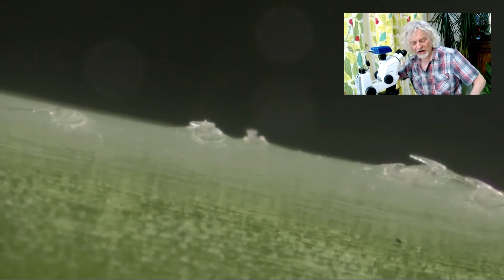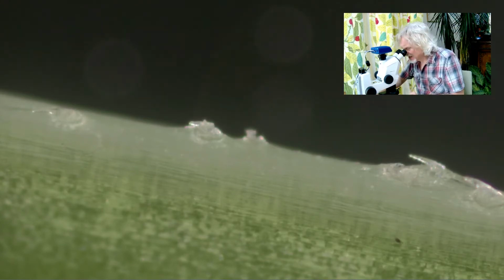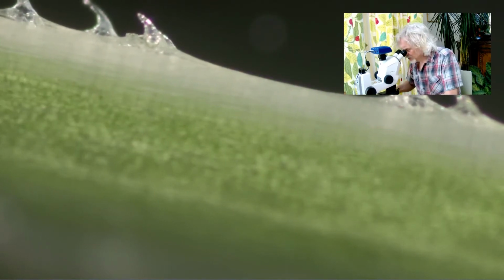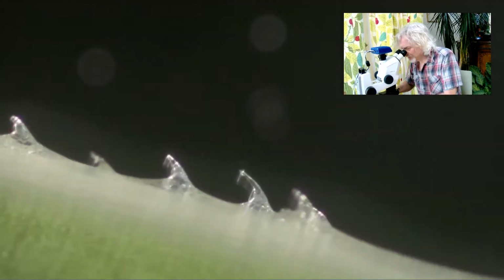This is very high magnification, and this is something that people forget. If I take this probe here, now this is a needle, this is a sharp needle. If I place this next to this, let me find a better hook. That one's a bit rubbish. I think I've sort of scraped a lot of these off in the process of manipulating and manoeuvring this thing here. Let's have a look at a different section here. Look, this bit looks a bit more like it's got some hooks on it. Look there. Right, you can see some, they're a bit high up. I'll move it down. There.